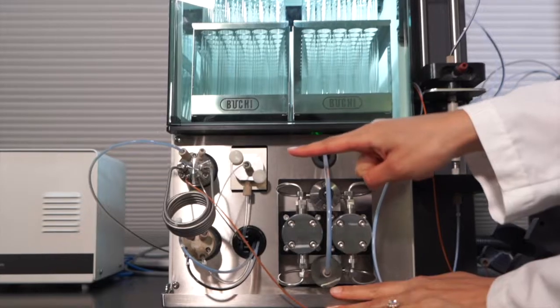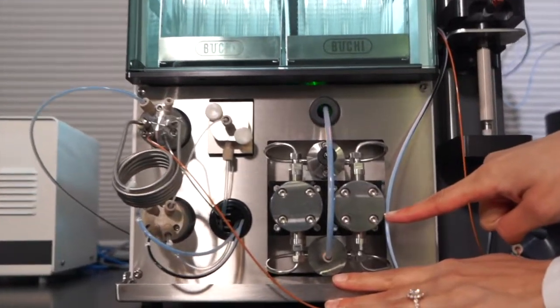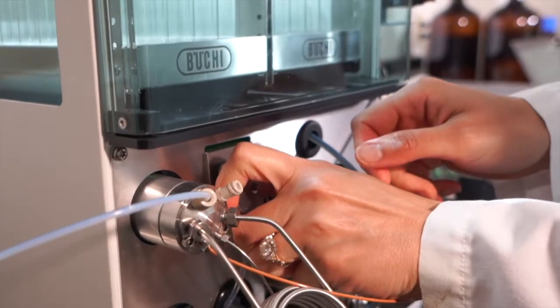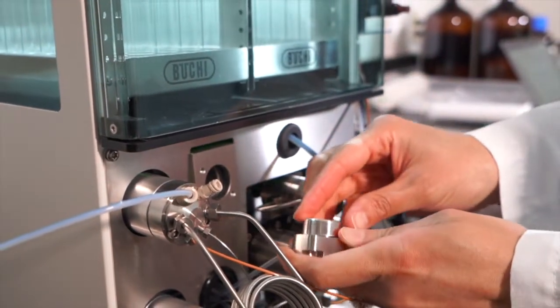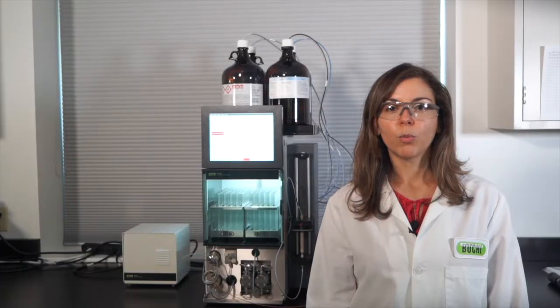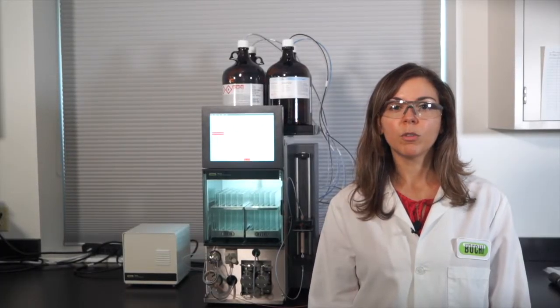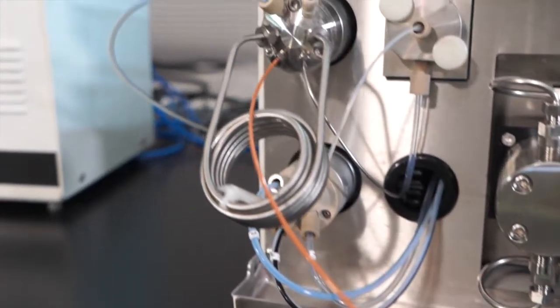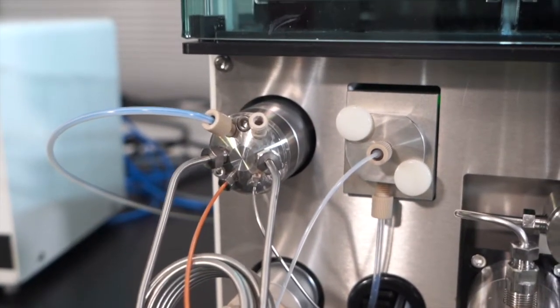It can be used as a semi-quantitative technique. It's indicative of relative quantities, where a high signal indicates a large amount of compound eluting. It provides valuable information on the ratio of the compounds in the sample. The flow splitter and ELSD nebulizer are both located on the front of the instrument. The nebulizer can be easily removed and cleaned. Here's how it works. Whatever elutes out of the cartridge will go into the valve, then will split into two parts. Most of the solvent will go through the UV-vis detector, and a fraction of the volume goes to the nebulizer for the ELSD.